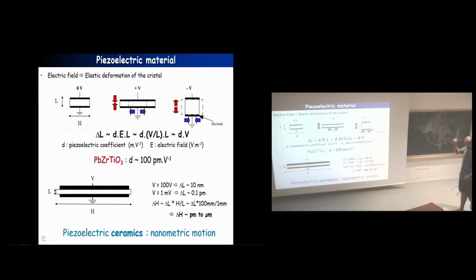It's pretty cool, but if you want to scan over microns, it's not enough, and you don't want to apply 10,000 volts, you will burn it. So you just have to shape your piezoelectric as a thin sheet, because you have to maintain constant volume, for a small distortion in the transverse orientation, you can have quite a large motion in the longitudinal one.